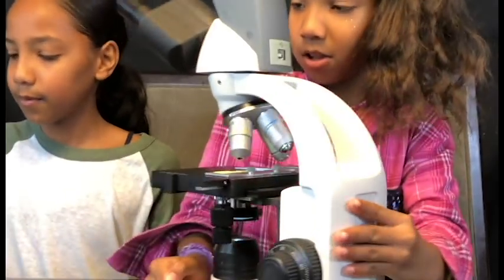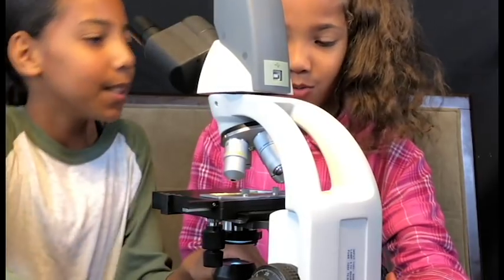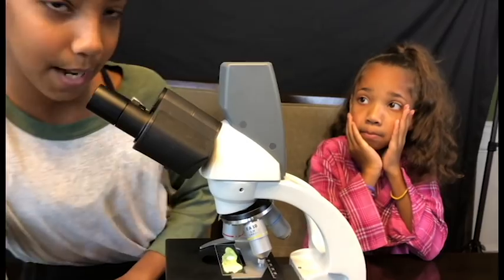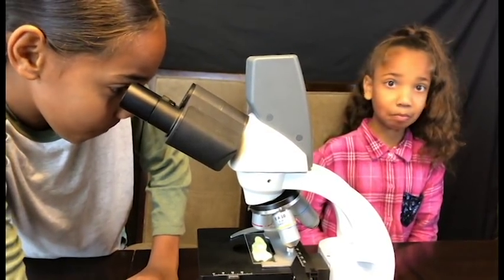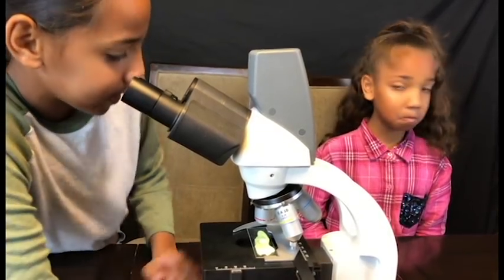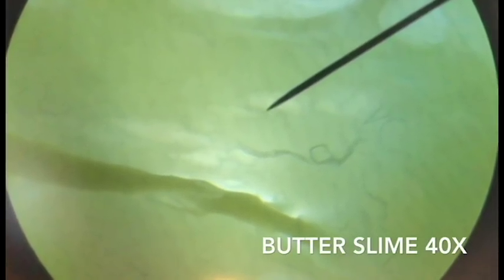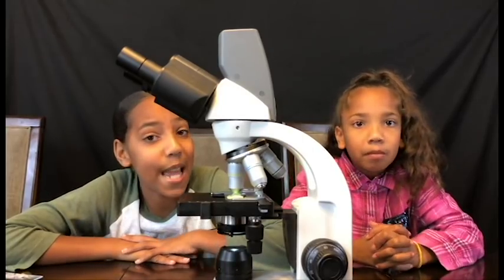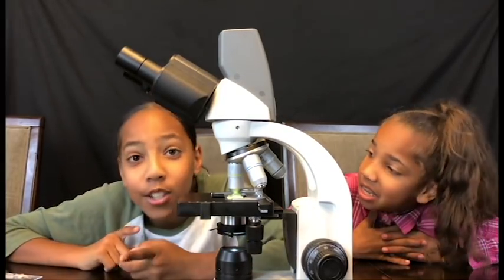Now I'm curious to see how my slime looks. Pass me the slime — it's gonna be awesome. Now I'm just gonna look in it. Wow. Look at it and adjust it — I'm iffy on this one. Oh wow, there's like squiggly stuff in it. I'm gonna try to get it in. Yeah, you see that? That one was interesting — like the wormish stuff.